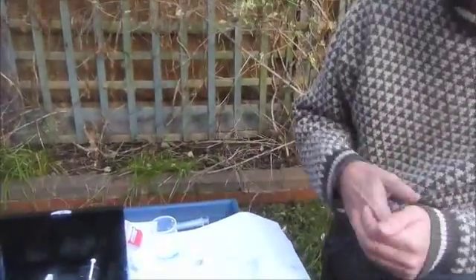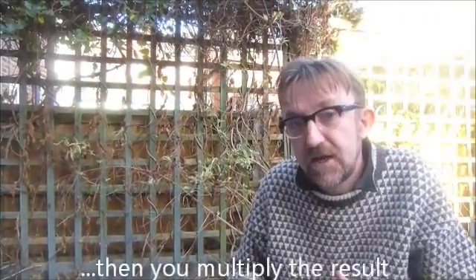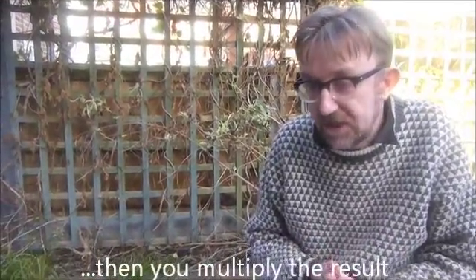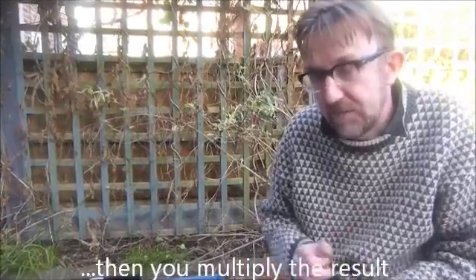Do the titration again and you should use 3 times as much acid. And then instead of multiplying by 300, you simply multiply by 100. That should give you much more sensitivity in the determination. It'll give you the same result, but just a bit more accuracy.